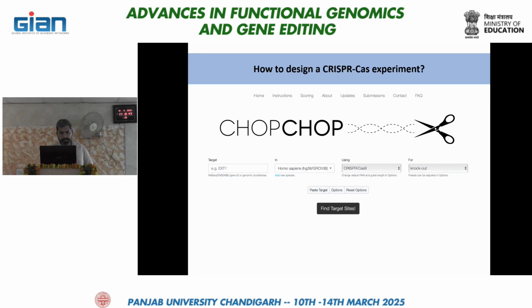So we will start with CHOPCHOP. This is one of the tools. You can just type CHOPCHOP CRISPR in Google, or let me be with you.